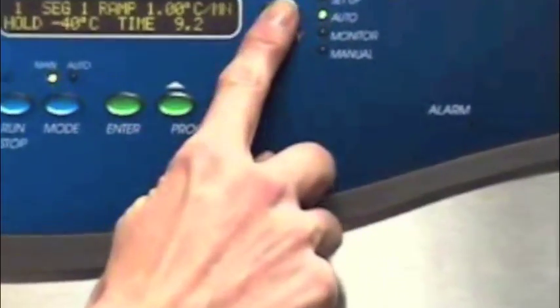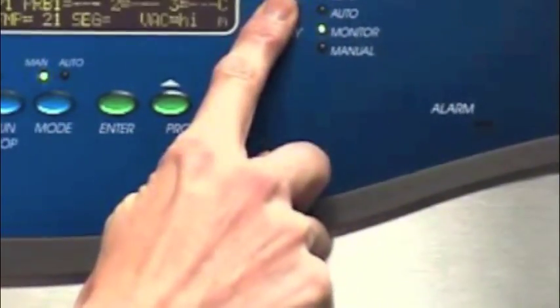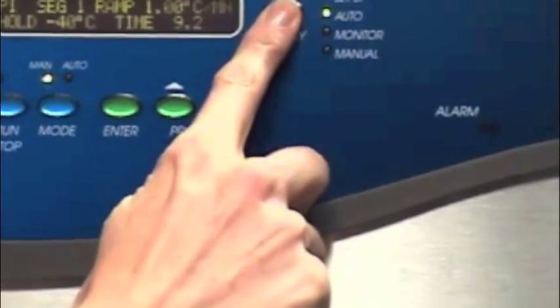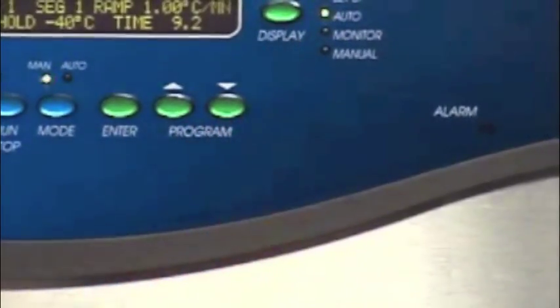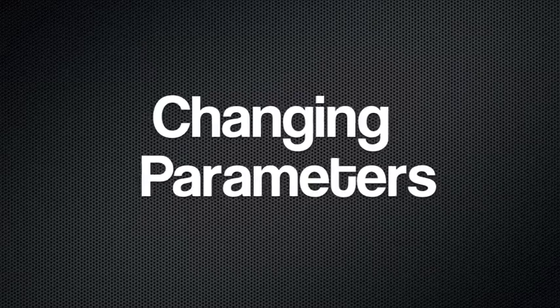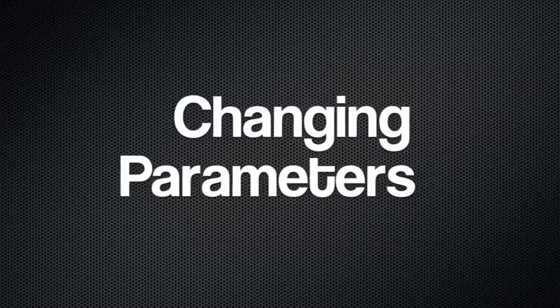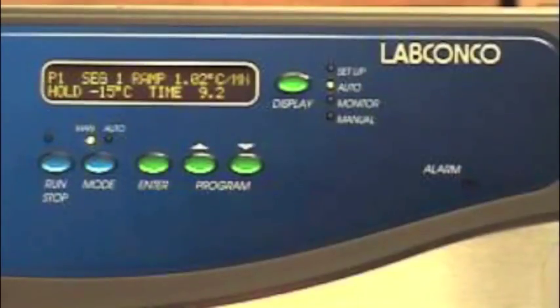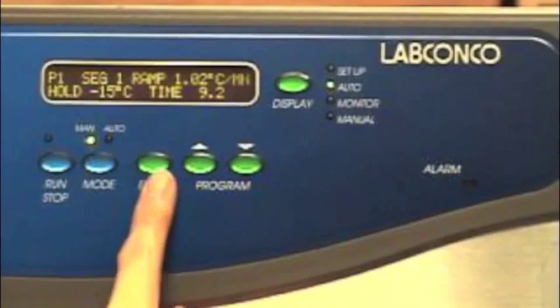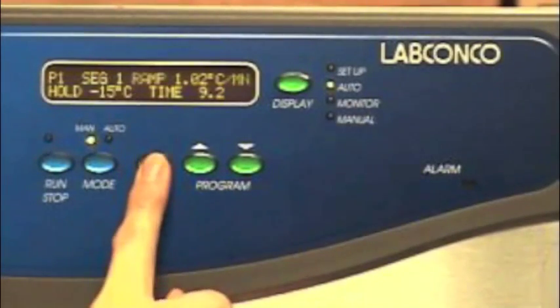Use the display button to move to auto mode. To toggle between the settings, use the enter key.